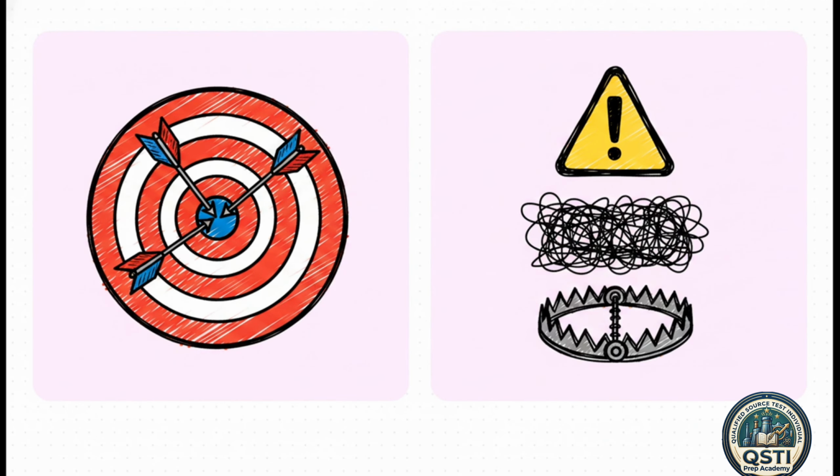Out in the field, you've got to understand exactly what we want versus what's trying to get in our way. Our target analytes here are O2 and CO2, but you will definitely encounter interferences. For example, acid gases like sulfur dioxide can totally mess with your CO2 measurements. And for O2, you've got to watch out for unsaturated hydrocarbons like acetone, nitrous oxide, and especially ammonia.